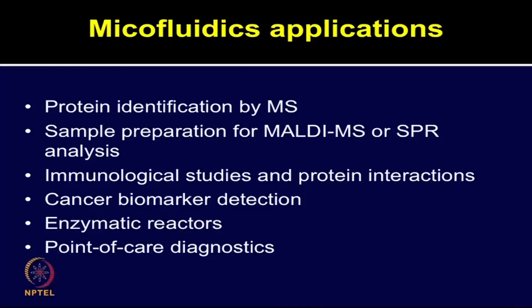Now, let us briefly discuss some of the major applications of microfluidics in proteomics. The protein identification is performed by mass spec.